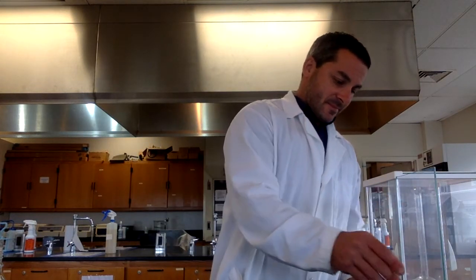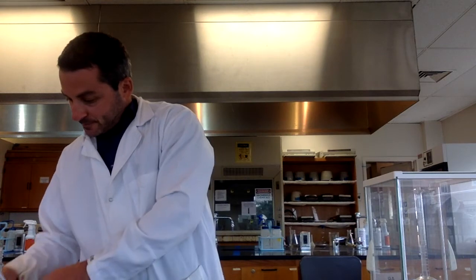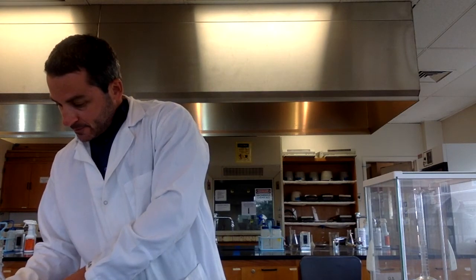Now I can reweigh it with the liquid in there. I get 38.967 grams. So the mass of the graduated cylinder with the liquid in it minus just the mass of the graduated cylinder will give me the mass of the liquid. I can take that mass, divide it by the volume, and I will get the density.